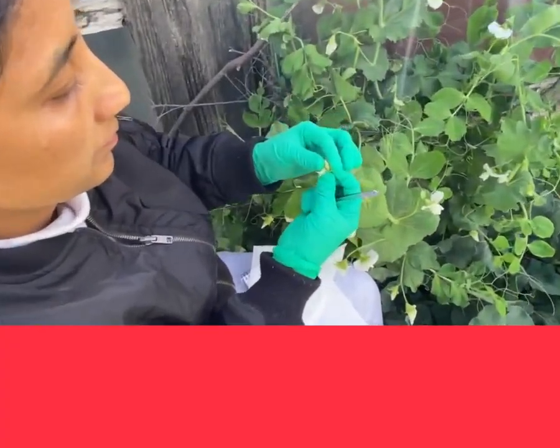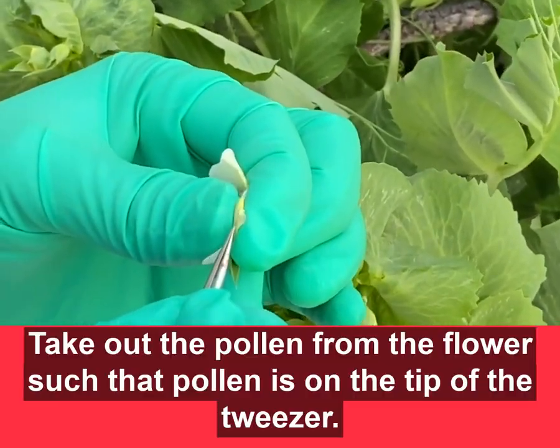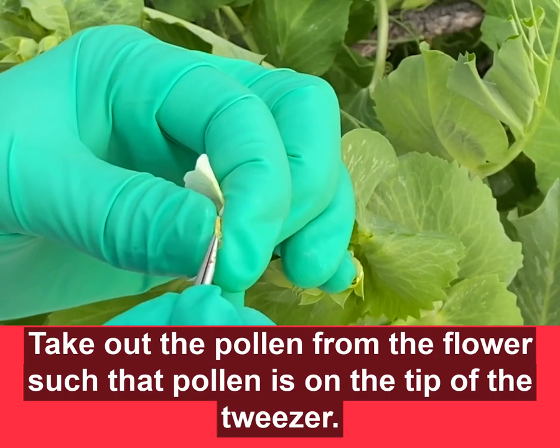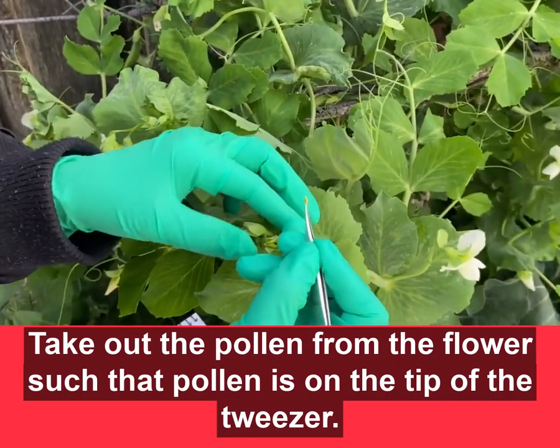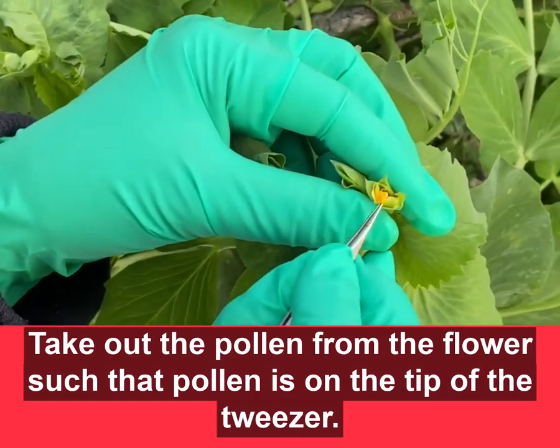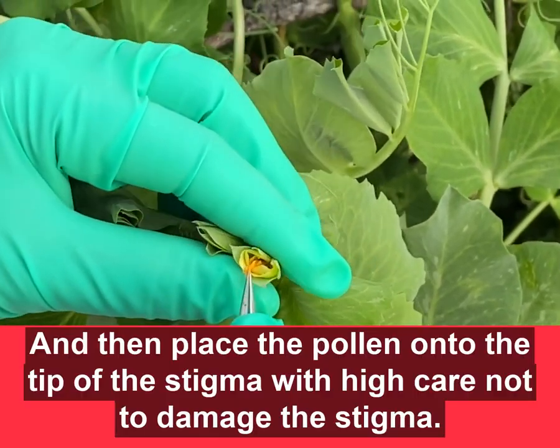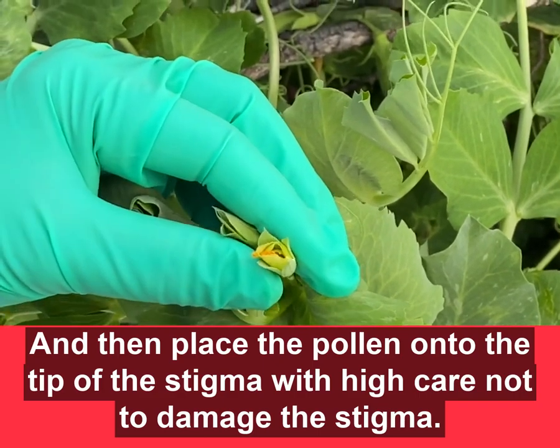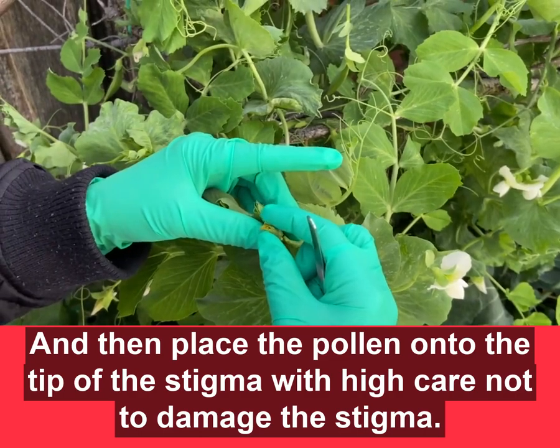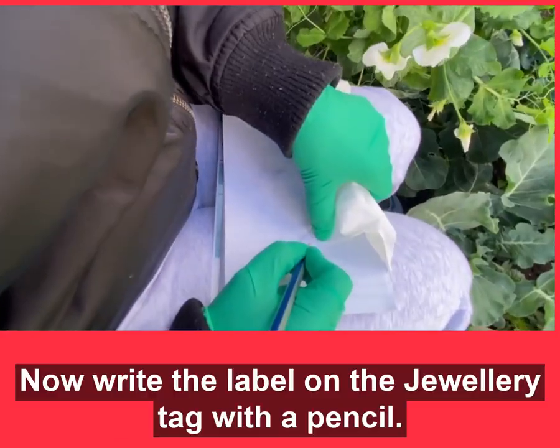Take the fresh flowers from the male plant and then take out the pollens with the help of tweezers. Take the pollens on the tip of the tweezers and then put it onto the tip of the stigma, and then give a slight wiggle so that the pollen gets well distributed on the female stigma.